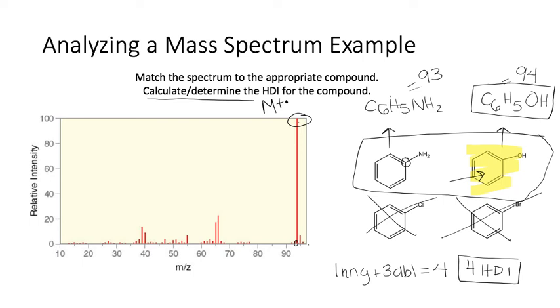You will see how to tie it with NMR, IR, and kind of figure out how to use this to predict everything. If I were to use IR for this, I should see an OH stretching group towards the left-hand side as we learned. So you can put these 2 techniques together.